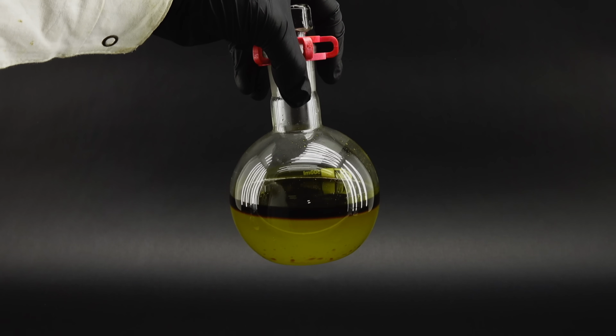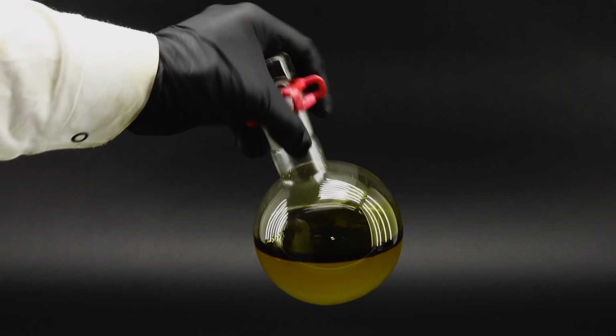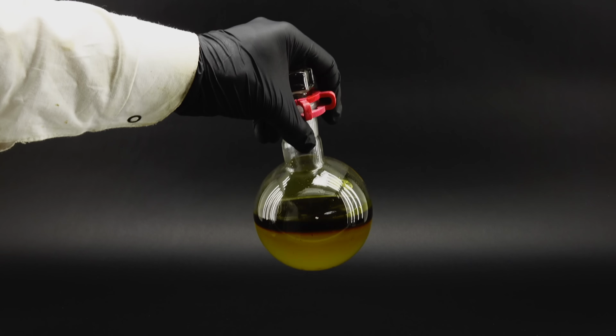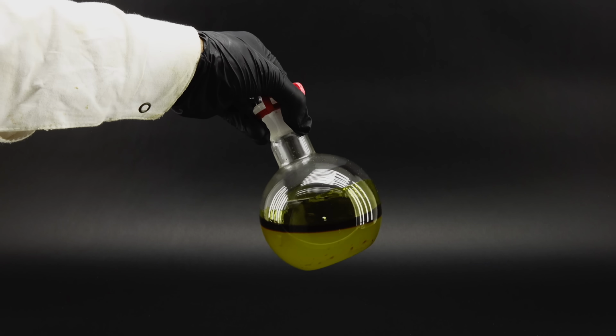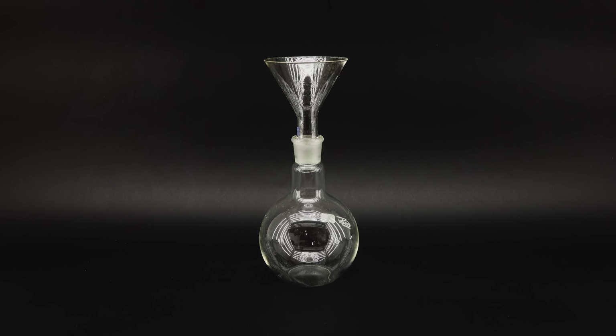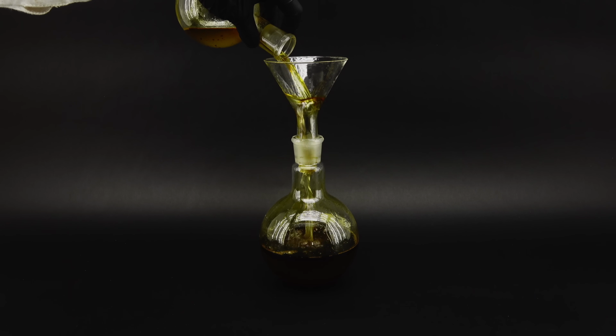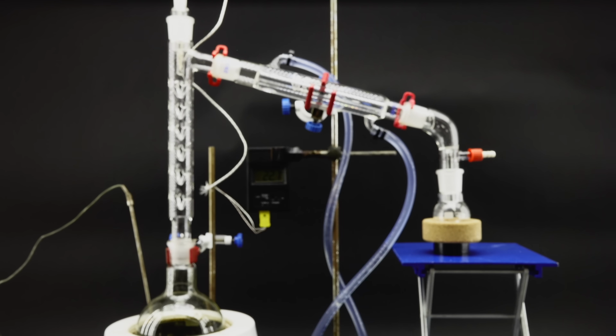However, benzene dissolves in ethylene glycol to some extent, and I wouldn't really be happy with losing a bunch of my product. Because of that, I decided that I will just distill the benzene out, which should nicely separate it from most other contaminants. For that, I poured the contents of both flasks into a bigger one and assembled it into a fractional distillation setup.